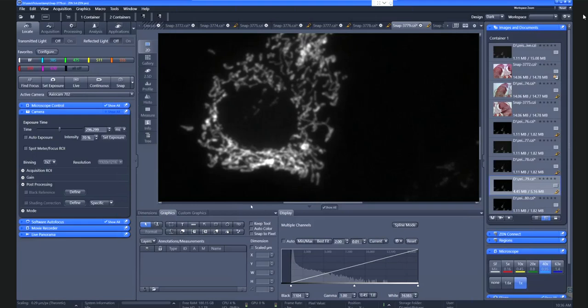This is always something we have to have in mind whenever we start a session on our microscope and we want to record our samples and images. It's always worth to spend a couple minutes thinking what is really needed at the end. Do I need a time series with tons of time points, or is it fine enough if I have intervals of 10 seconds or 10 minutes or something? Do I always need a super resolved image where I only want to count cell nuclei? So maybe then it's worth to reduce resolution and live with an image which allows to go with short exposure.